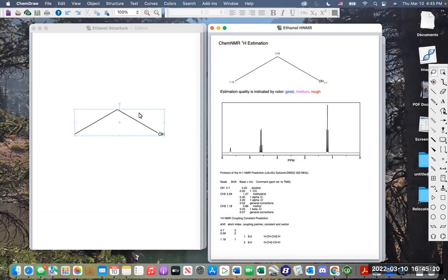The three hydrogens which make up the methyl group can all be considered chemically equivalent, as they all exist in the same chemical environment. In other words, all three hydrogens are bonded in the same way to the same sp3 hybridized carbon and will therefore be expressed as one signal on the proton NMR spectrum for ethanol. The two hydrogens bonded to the second sp3 carbon are chemically equivalent to each other, as they are bonded to the same atom and are equally distant from the hydroxy group in comparison with one another.